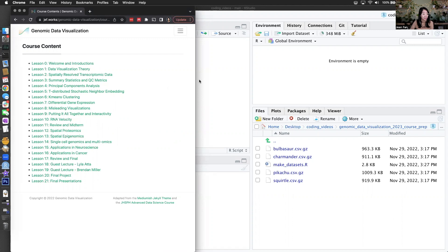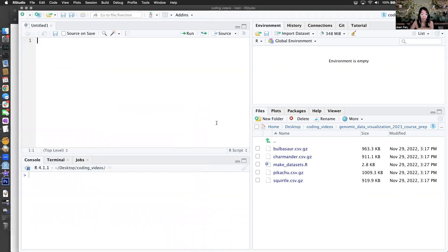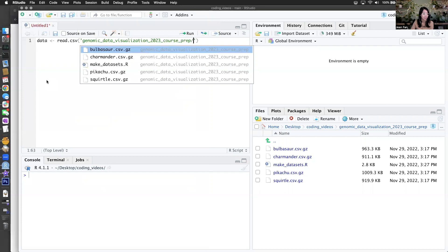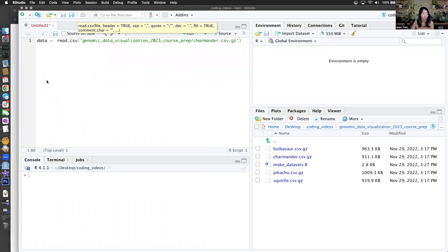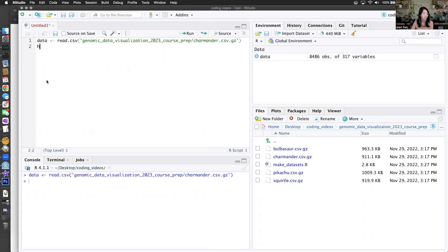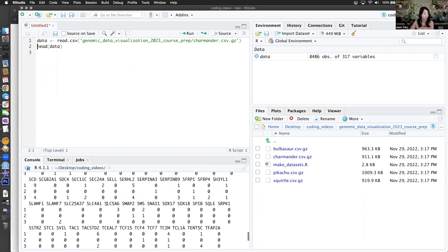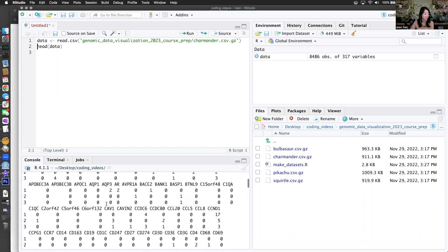I've already prepared a couple of data sets for the students, and today I will just be running through the analyses to make sure that what I'm asking the students to do is feasible. I'm going to try to do most things in base R, since some students have PCs, some have Macs, and some have Linux, so we don't want to end up in dependency hell trying to install too many things.